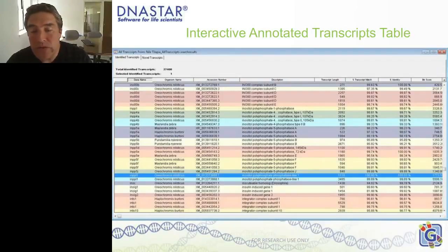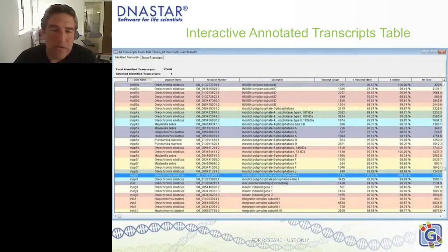And those are extremely troublesome when you're trying to annotate a transcriptome, because they're in there twice, and there could be thousands of those in some data sets. And so it's extremely laborious to go through and figure out where all the duplicates are. So what we do here is we group them, and you can see this kind of crazy color scheme. The grouping is saying that these hit the same gene, in this case. They have the same gene name, so we're going to group them together.